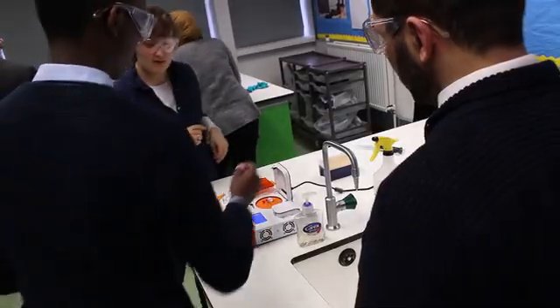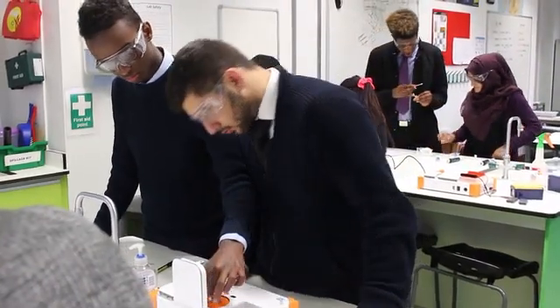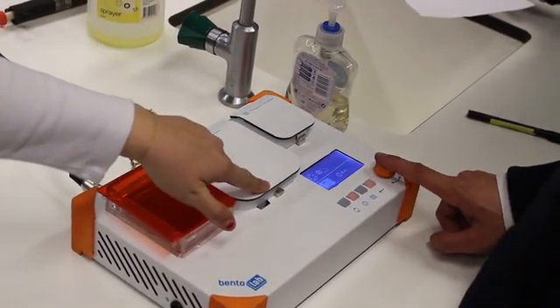Things like a centrifuge, a PCR machine, gel electrophoresis — all those bits of kit individually are very expensive. So it's really great that devices come along where you can get everything in one small package, which is really simple for the kids to use.